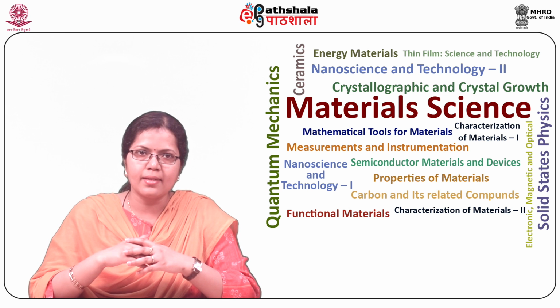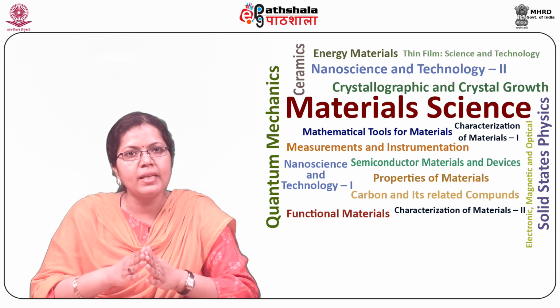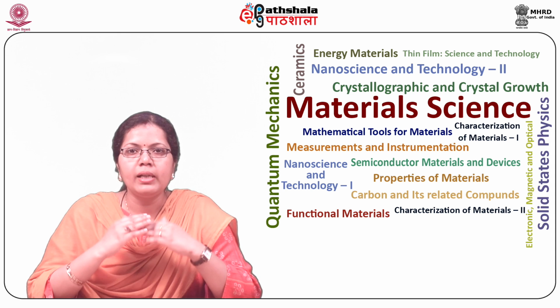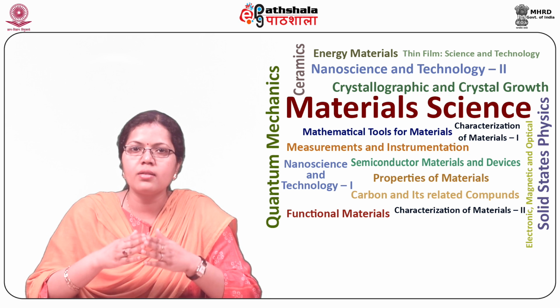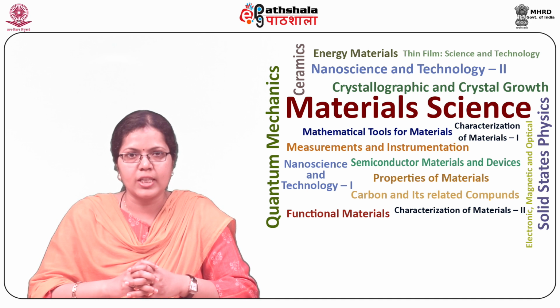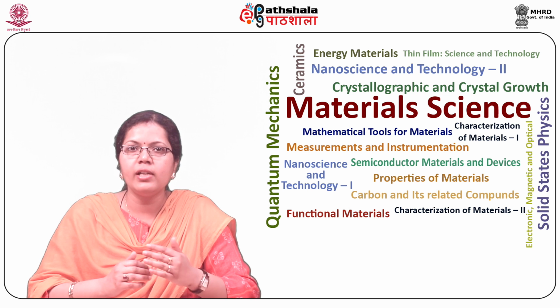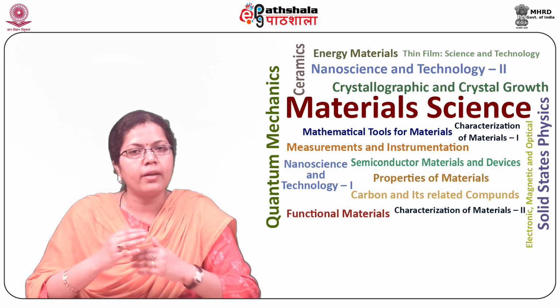Students, now let us understand bright field microscopy. Bright field microscopy is the simplest illumination technique. White light is used in bright field microscopy. In bright field microscopy, the sample is illuminated from below and observed from above. The contrast of the sample in dense areas is generally caused by the attenuation of the transmitted light. It is the simplest technique, due to which it is popular and widely used. In bright field microscopy, the image of the sample is a dark image on a bright background.